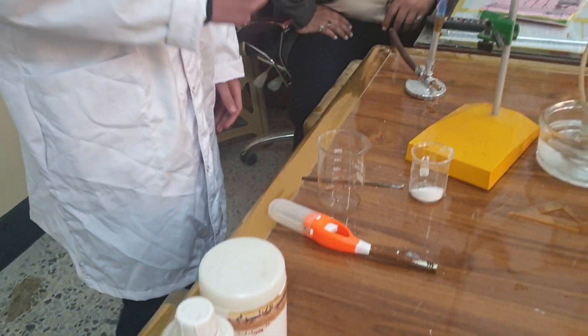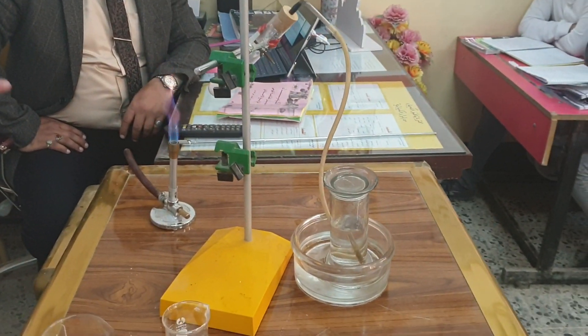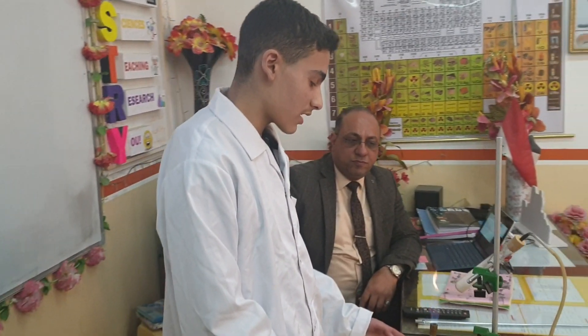To prepare methane in the laboratory, you need to heat sodium acetate along with calcium oxide and sodium hydroxide, because the mixture will have little effect on glass and will ensure a high melting point for sodium hydroxide. The resulting gas can be collected by moving the water further down.